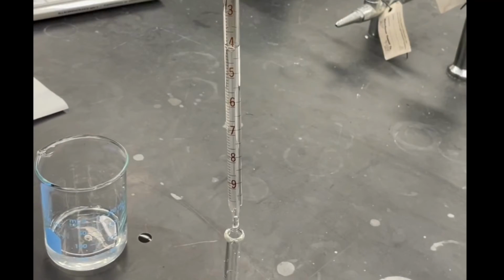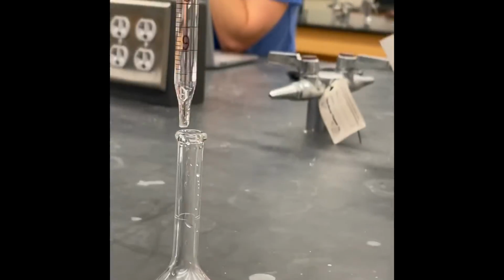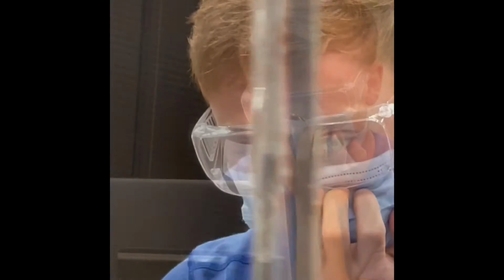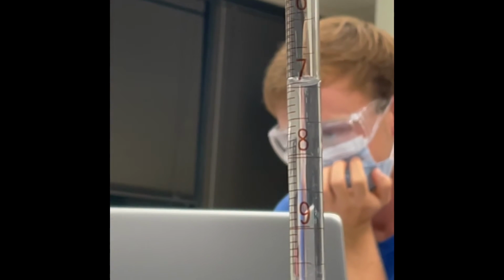Next, transfer some of your solution into a volumetric flask and observe the pipette's new meniscus to calculate the pipette's final volume. In this video, we can see that the pipette's new meniscus sits at 7.0 milliliters. To determine the amount of solution you deposited in the flask, subtract the pipette's final volume from its initial volume. This number will be later used as the initial volume of the stock solution.